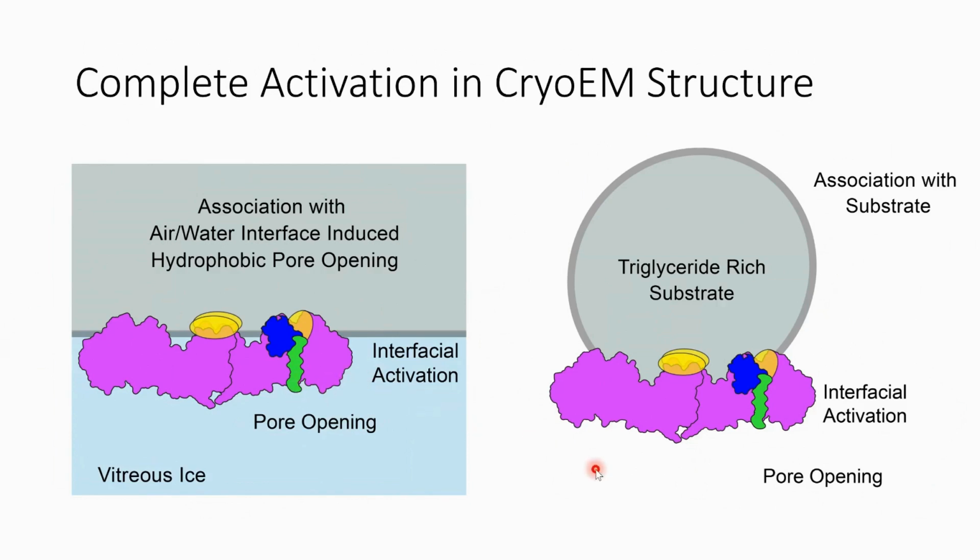Whereas if you had LPL in a soluble environment where you have hydrophilic interaction with the LPL active site, you're not going to favor the opening of a hydrophobic pore. In fact, it would be extremely disfavored because it'd be better for that hydrophobic pore to stay closed, as that would be a lot more energetically favorable. However, the air-water interface can act as a mimic potentially for this triglyceride-rich substrate in terms of opening of the pore.